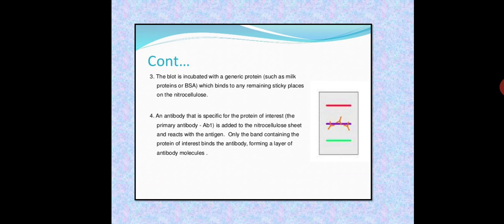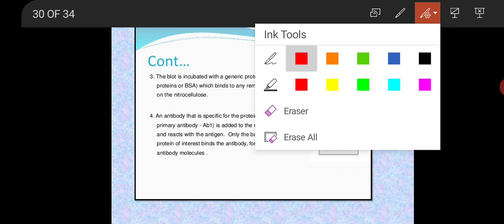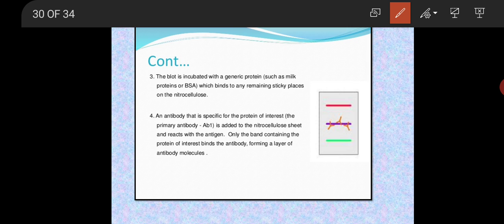Now we have transferred that gel containing separated protein onto that nylon or nitrocellulose membrane. Now what we will do, imagine the diagram. Okay, let me show the diagram. Suppose now consider the side position of that membrane and gel. Okay, side view consider कीजिए. This is the membrane, that is nitrocellulose membrane or nylon membrane.